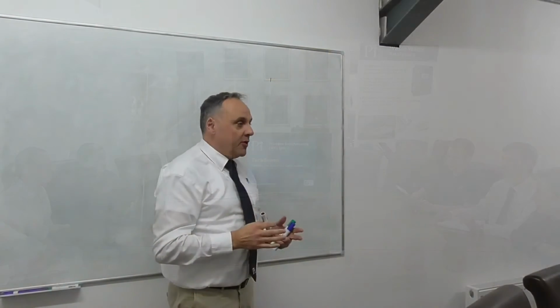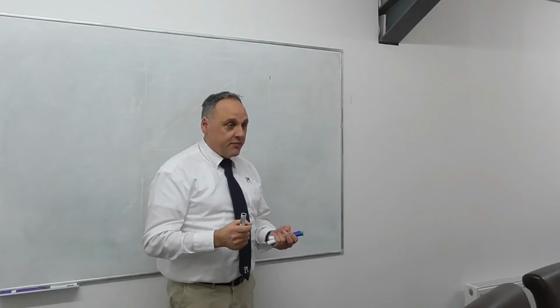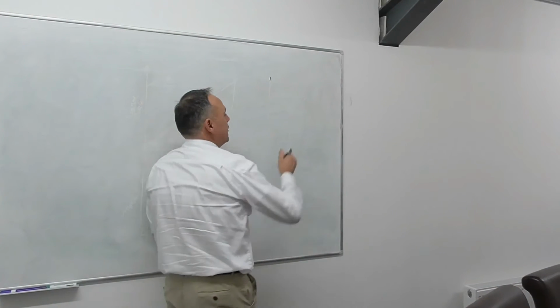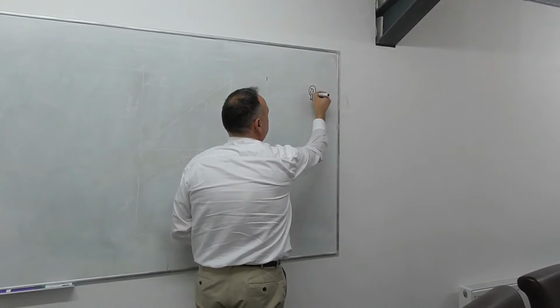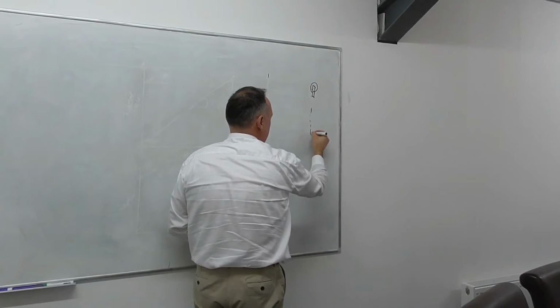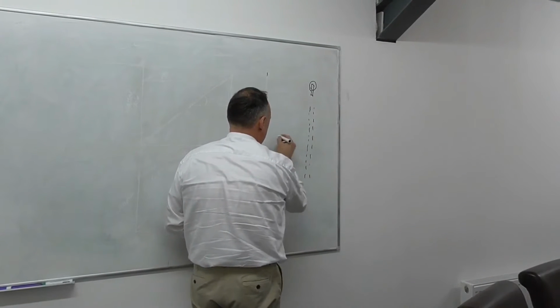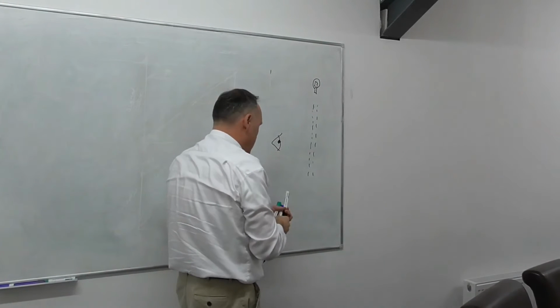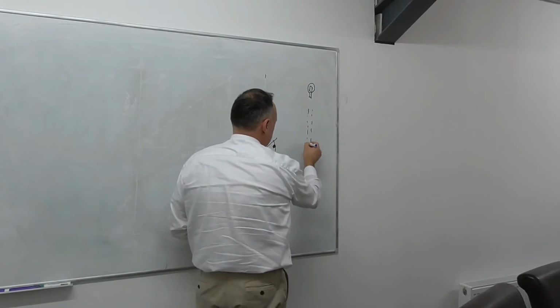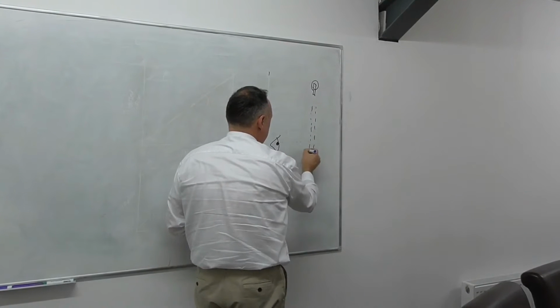To understand how TurbSense really works, we're going to have to look at a little bit of physics. So, nephelometric turbidity requires a light source, a beam of light, and a detector to catch the light that is refracted through 90 degrees to that detector.